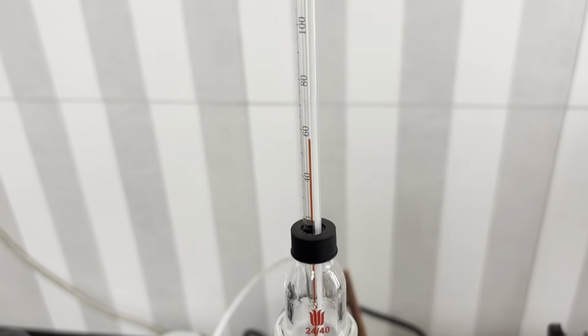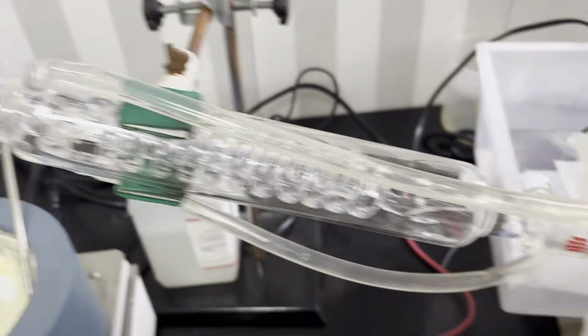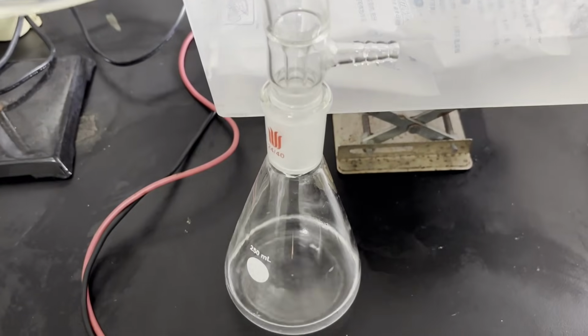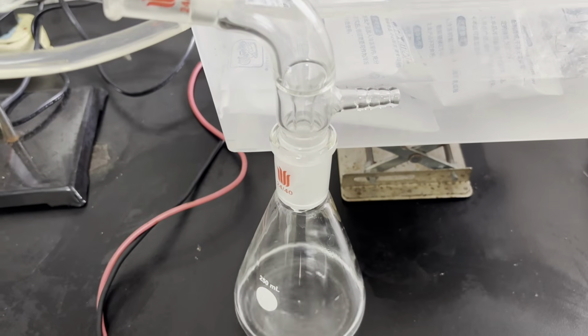The great thing about this method is that the setup only required minimal interference in the next 2 hours or so, where 500 ml of diacetone alcohol is quantitatively converted to acetone. Now what is happening here?